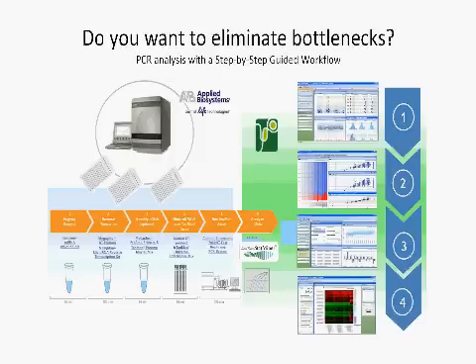Usually, either people are not familiar with all of the steps of the analysis, they're not familiar with what type of methods or algorithms to use, and also, with this type of data, it could get quite complex with many variables. So, just making sure that there is a specific workflow ensures that everyone who can perform the experiments can also do the data analysis.